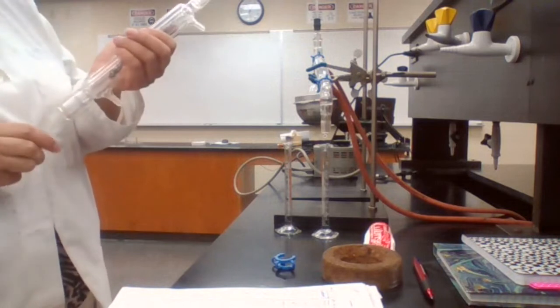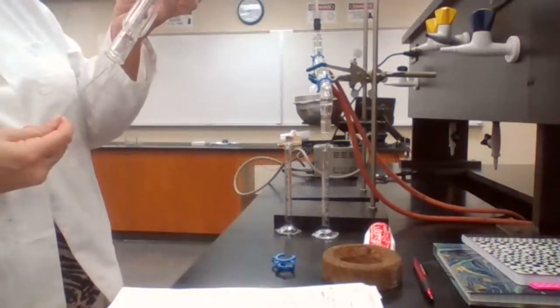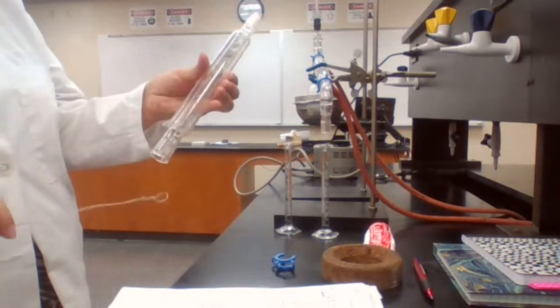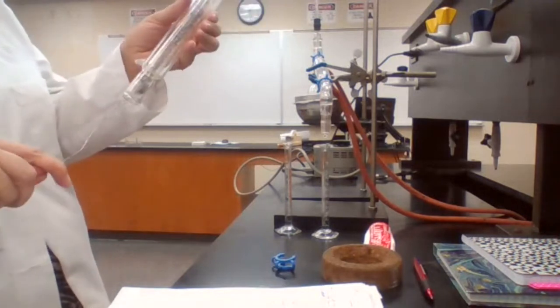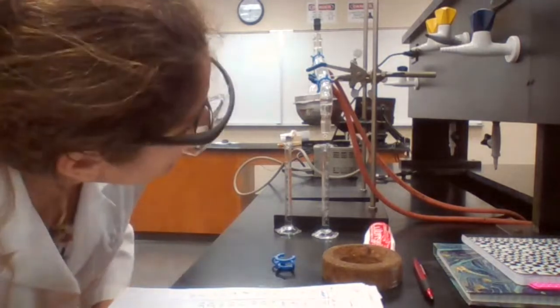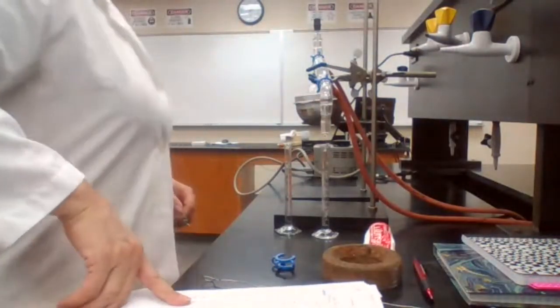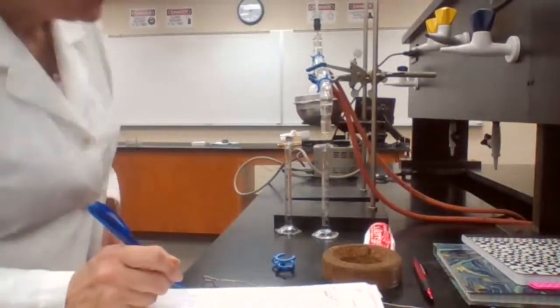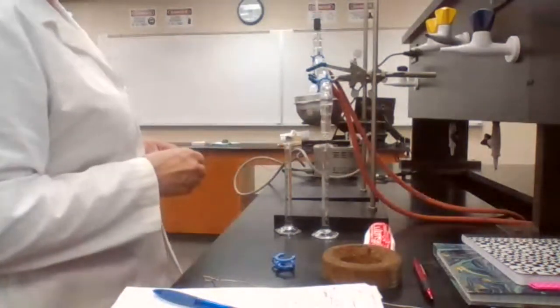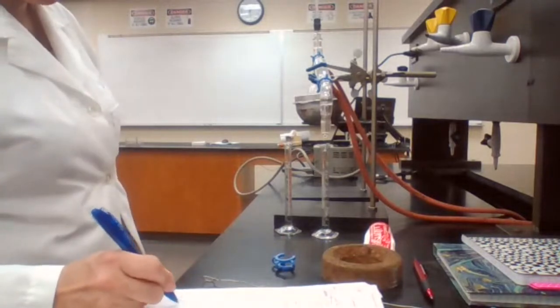It's not bad. 13 milliliters. Did I give you the 13? 76. And 14 milliliters is 77.